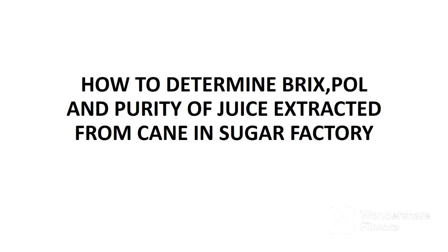In the previous video, I gave a brief introduction on sugar laboratory. I talked about functions of laboratory in sugar industry, examples of samples, and I listed out some of the analysis done in this lab. Today, I'm going to start with the first analysis, which is determination of Brix, pol, and purity of juice extracted from sugarcane.